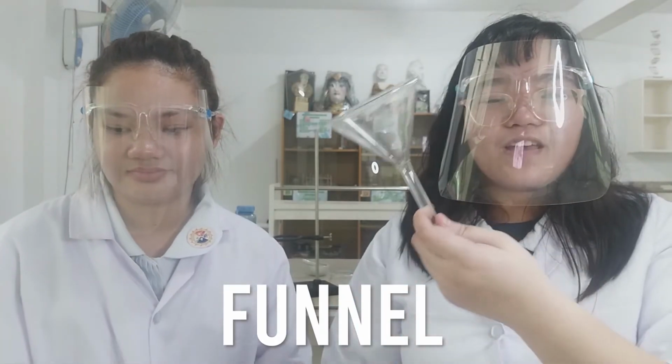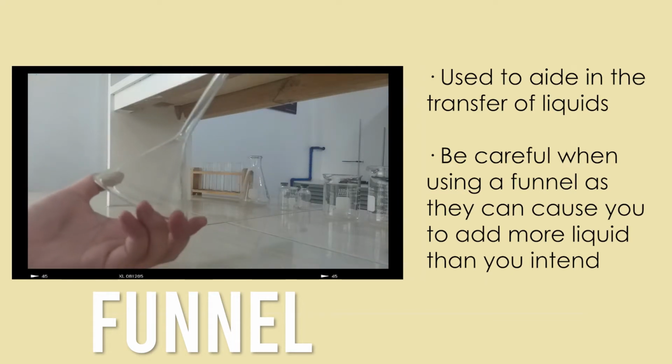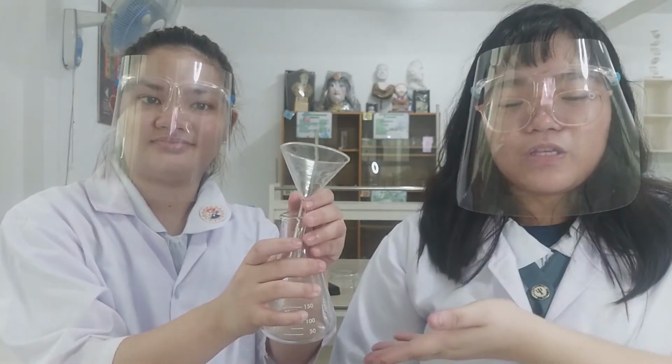The last category consists of lab equipment of various types. So the first thing in our list is a funnel. A funnel is used for filtration, and it is also used for transferring liquids to avoid spillage, just like what she demonstrated.